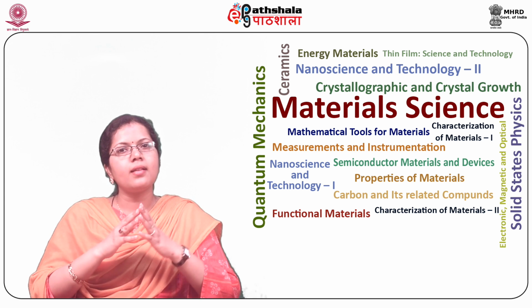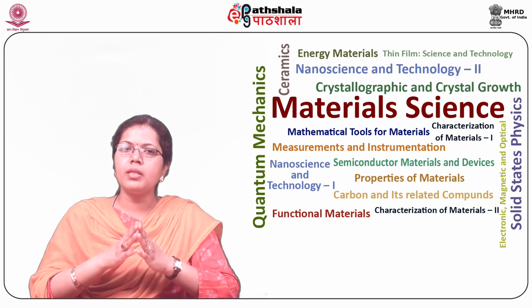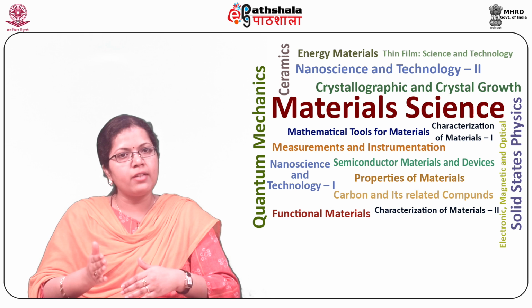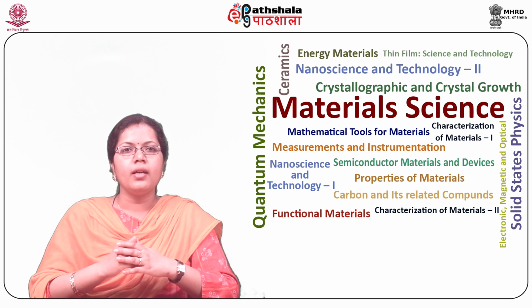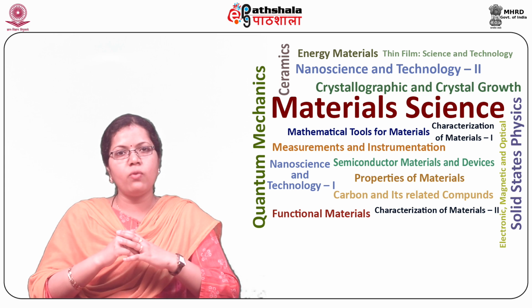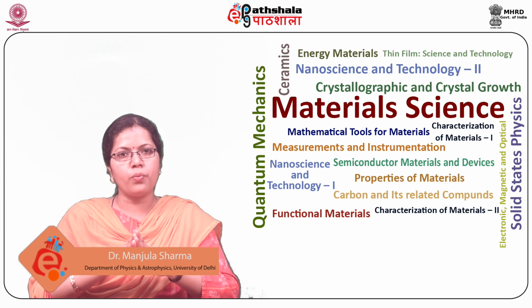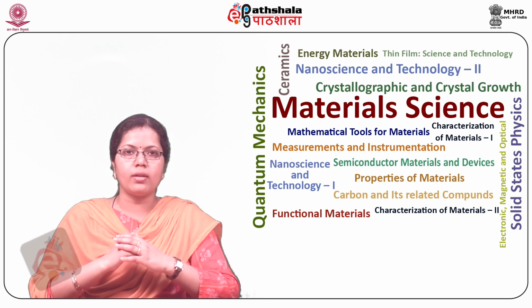So, students, let us summarize what we have learned in this module. We learned about the optical microscopy, in which we covered the geometrical optics, its magnification, resolving power, the depth of field, and the contrast. Secondly, we studied about the bright field microscopy, in which we covered its light path, the performance, and the advantages. Thirdly, we studied about the dark field optical microscopy, in which again we studied about its light path, the performance, and the advantages.